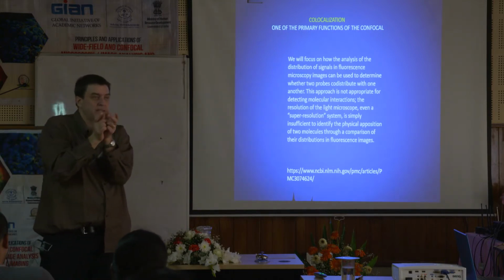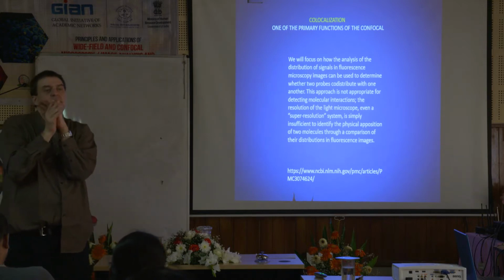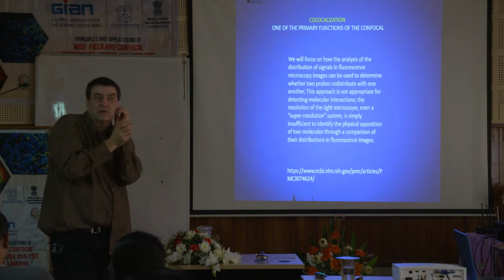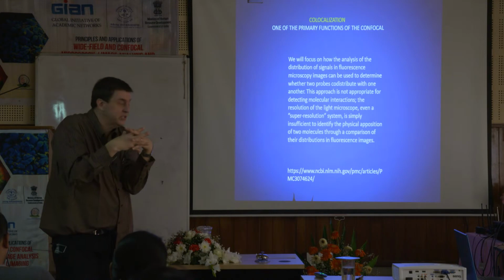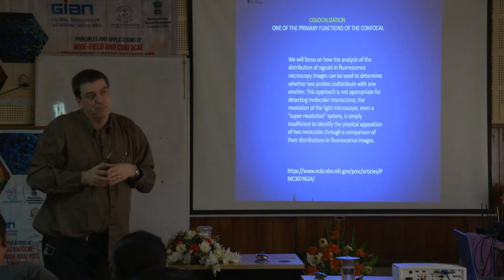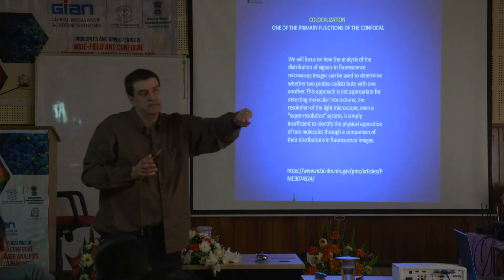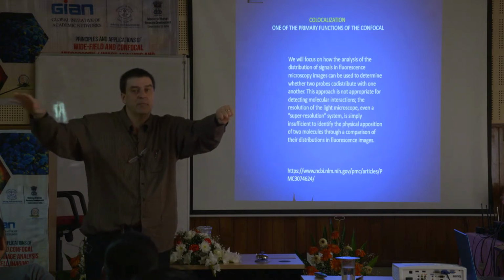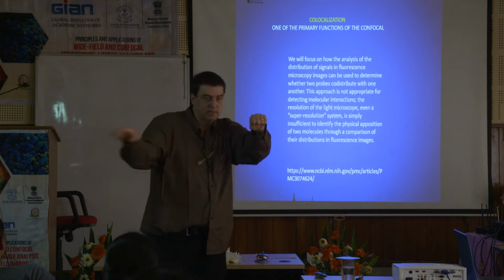A lot of times people tell me, "Oh, this proves..." No, it doesn't prove that. You need to use other techniques, biochemical techniques and such. And we'll talk about something a little later called FRET that helps prove that tightness of association. But co-localization is nice for, say, when you have a protein A and a protein B, and you add a drug, and it seems like every time we add this drug, protein B runs over here next to protein A. That seems to draw an association.